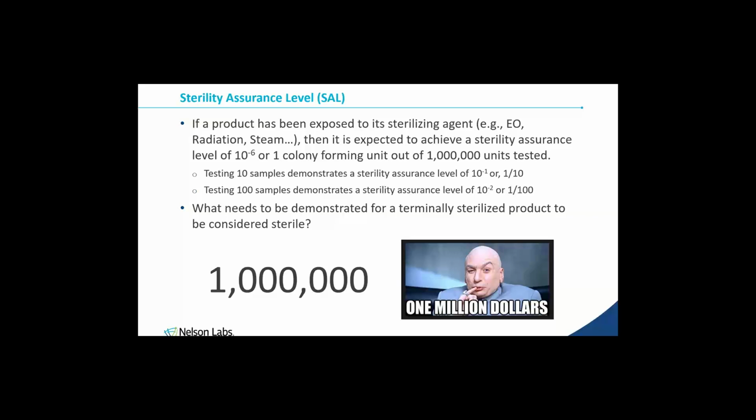So that kind of leads to some of the questions that we've received over the last few months and over the last year of, well, I have sterile product, and what do I do with it to show that it's still sterile or to extend its life, to basically assess that sterility? So that's where we get to the next part.